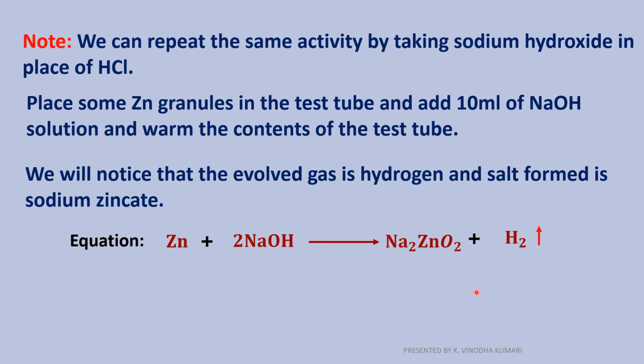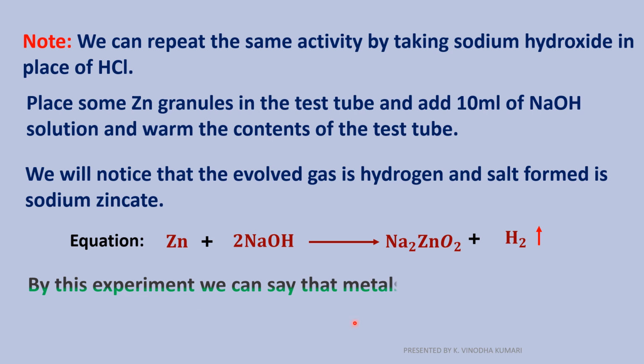So from this activity we can say that metals react with acids and bases, giving rise to hydrogen gas.